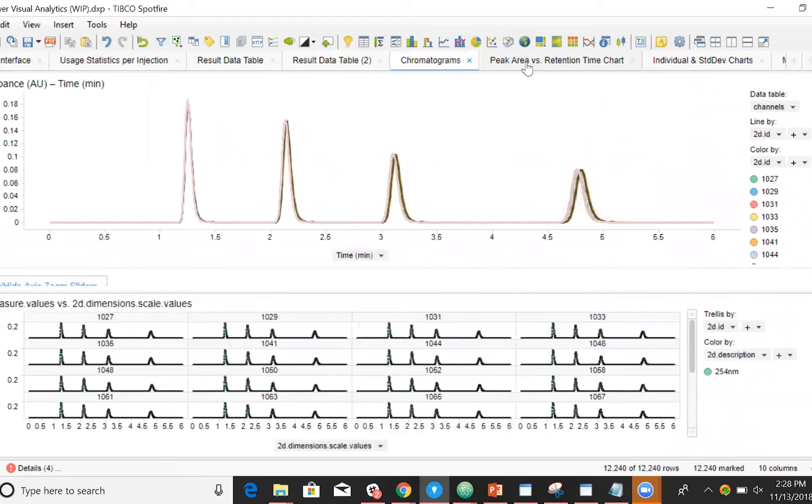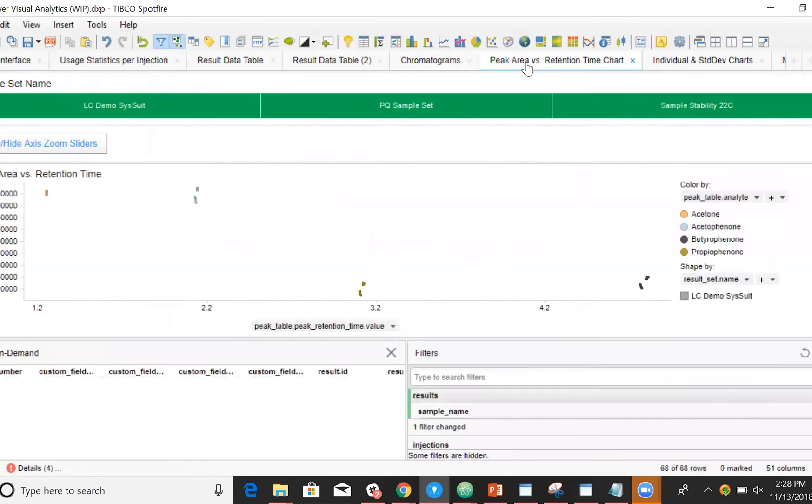In this template, we can view the results table, where we can see an overlay of different chromatograms of our selected injections. Additionally, we can relate the chromatograms with different injection metadata.